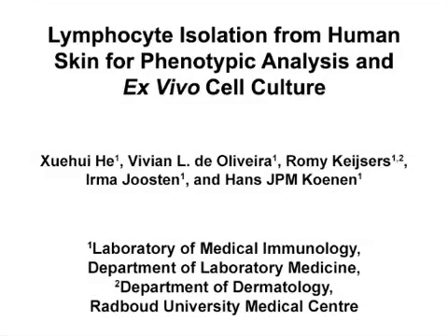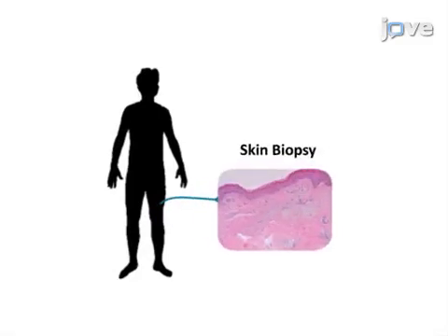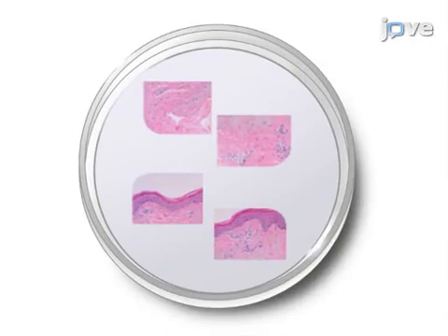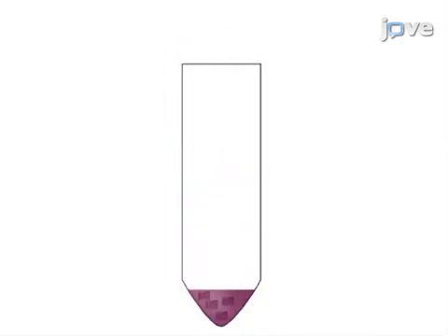The overall goal of this procedure is to efficiently isolate skin resident T-cells from human skin biopsies. This is accomplished by first obtaining human skin biopsies using a round biopsy punch. Next, each skin biopsy is cut into four smaller pieces in a petri dish. Then the skin tissue is mechanically and enzymatically dissociated to produce a single cell suspension.